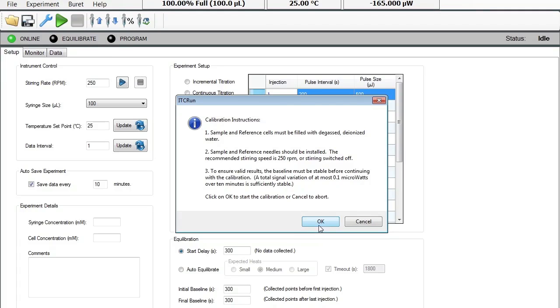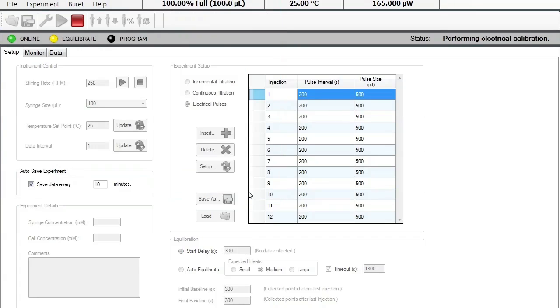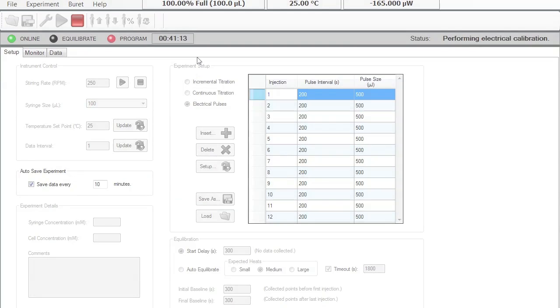You can then click OK and save your data file for your calibration as you would like. Click Save and then you will see the calibration starts and it takes roughly 42 minutes.